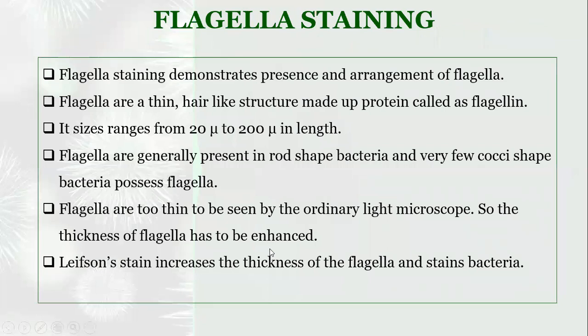Next, flagella staining. Flagella staining is to identify the presence and the arrangement of the flagella. Flagella are thin hair-like structures made up of a protein known as flagellin.